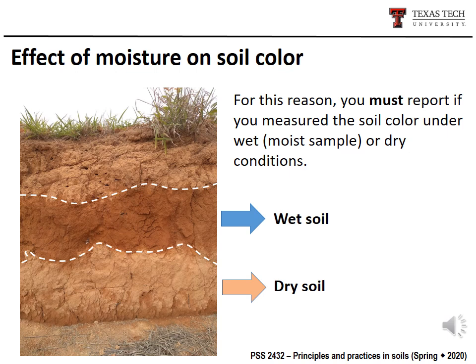The answer is no. You can see here different regions, but influenced by moisture. You can see clearly a wet region and a dry region.